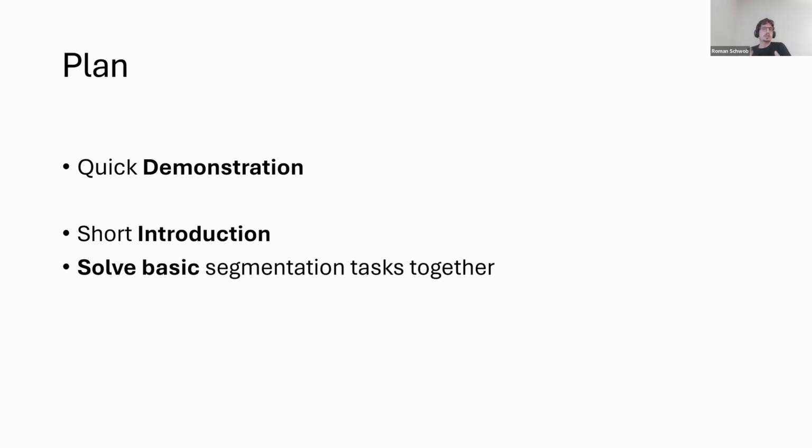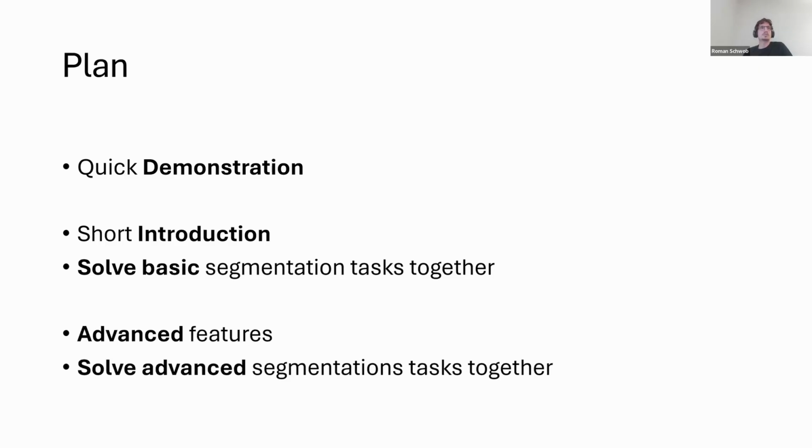So my goal is not only to tell you things, but in case you've been able to install the tool in advance, maybe you can also go along with some basic segmentation tasks that I'm going to show you here. And then in the second part, I'm just going to briefly explain some advanced features and show you how to solve them in Convpaint. So this is the plan, and I hope that I can show you a little bit how Convpaint might be useful to you.